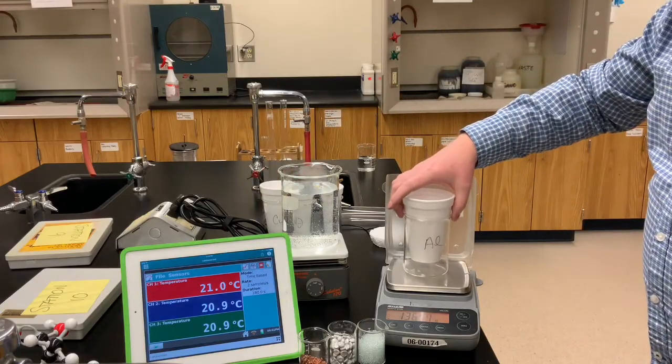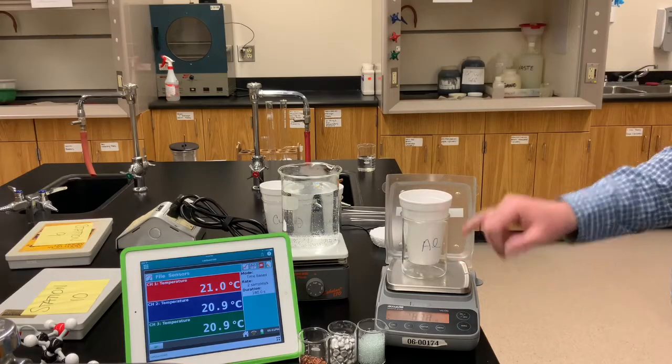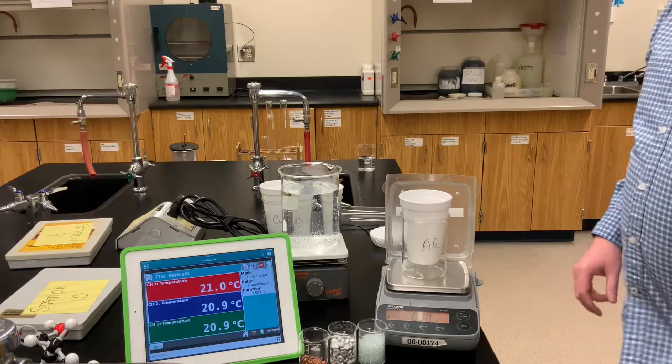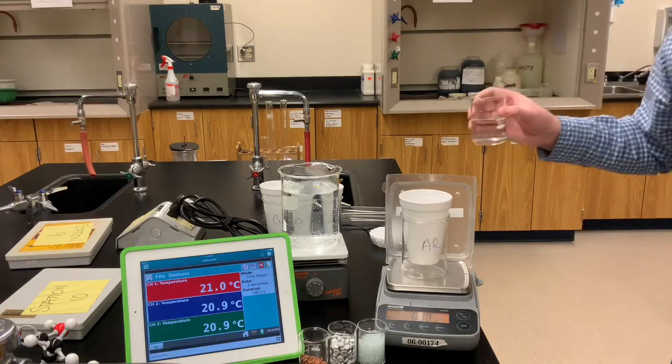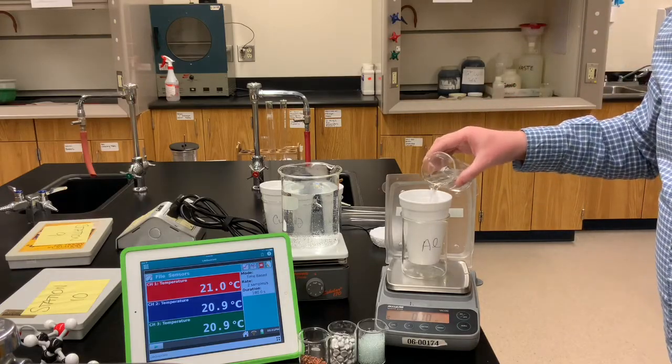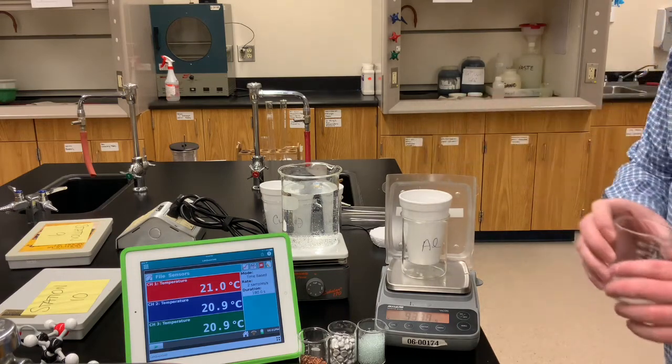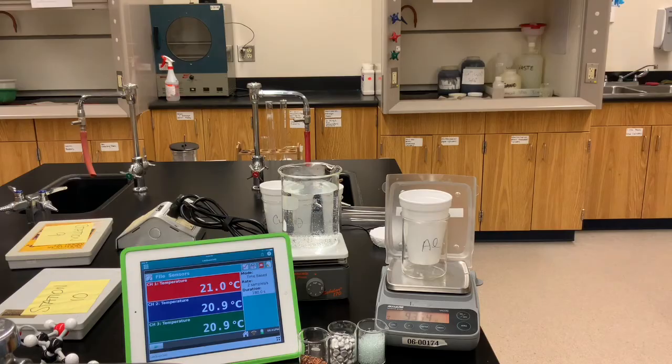Our third calorimeter is going to be used for the aluminum. I'll zero the balance and add some tap water. Record for yourself the mass of the water we're using in the aluminum calorimeter.